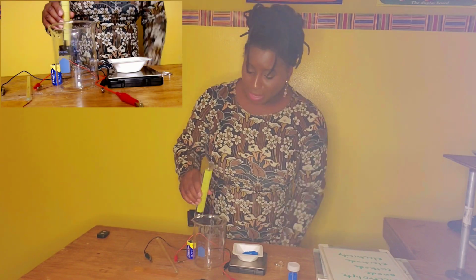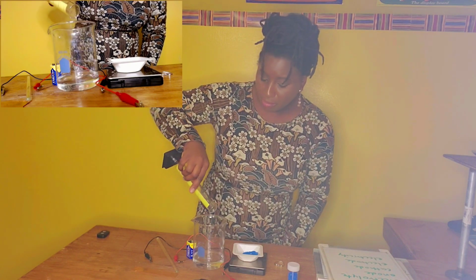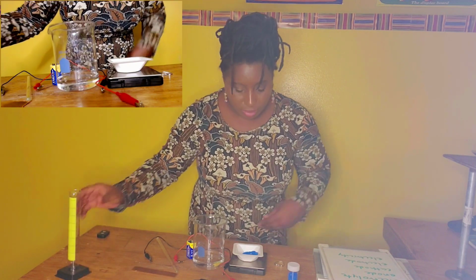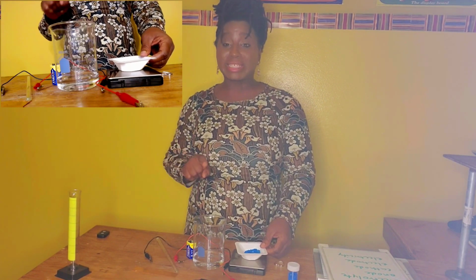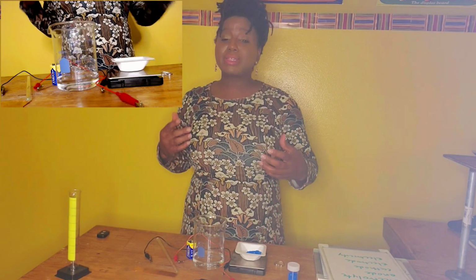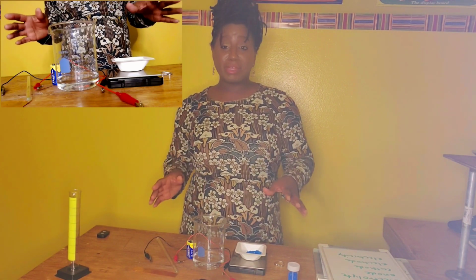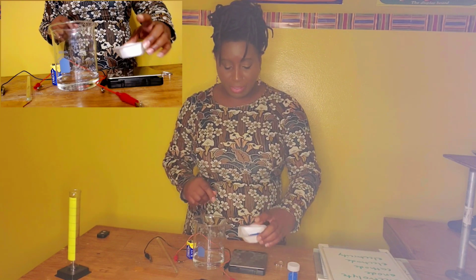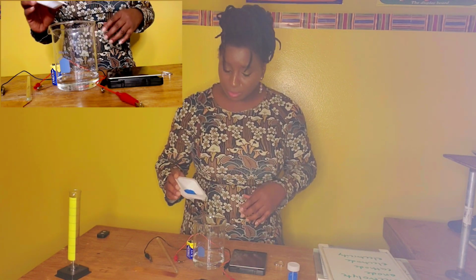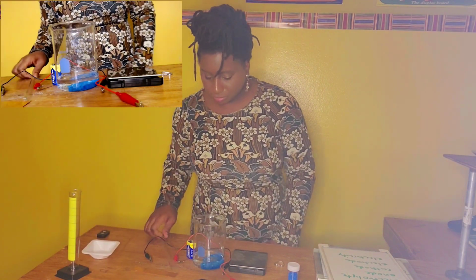So we're going to simply make our copper sulfate solution by pouring our 100 milliliters of distilled water. You want distilled water because you want a pure solution. You don't want any minerals that will contaminate your solution. I've already pre-measured out 10 grams of copper sulfate. So we're going to pour that right in.